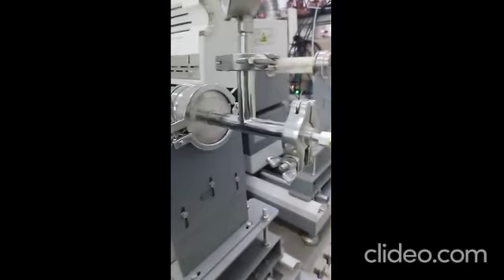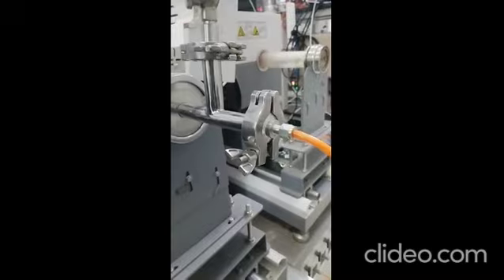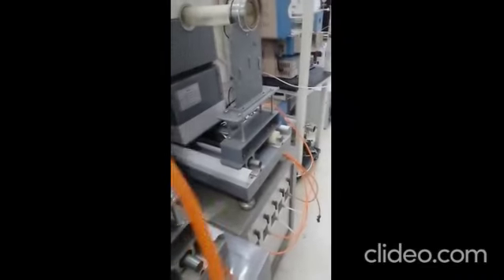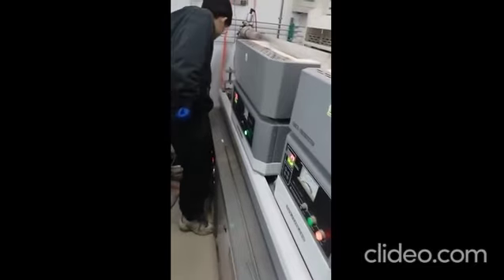And this one is argon supply, Ar. Okay. And maybe this is CH4. CH4, I think so, not argon. What do you think? Argon and CH4.